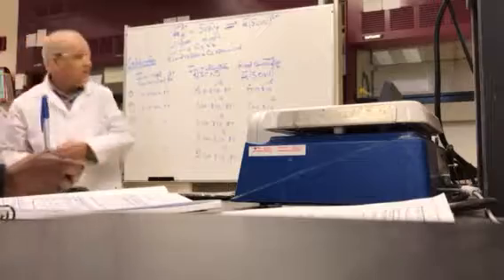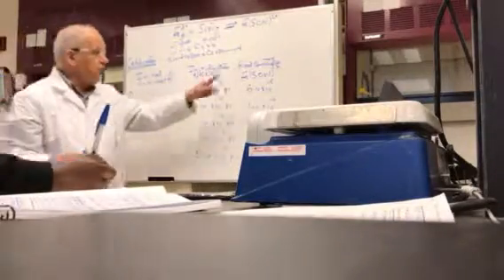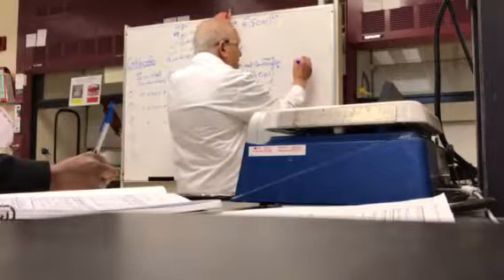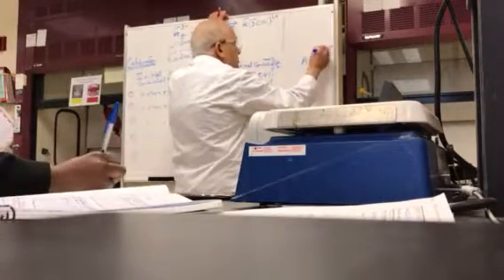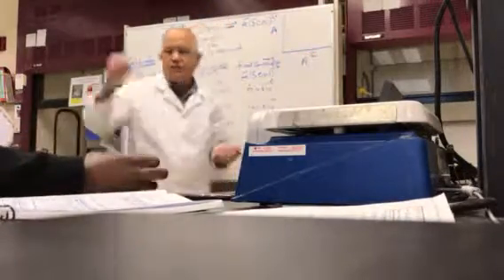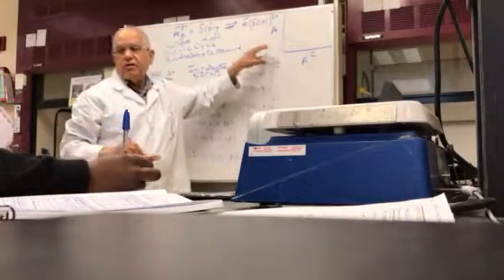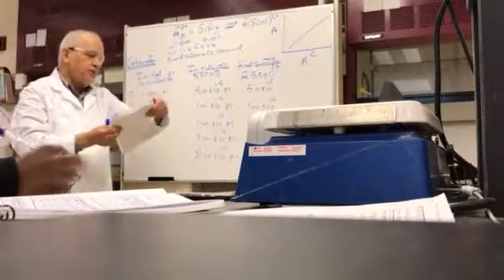This is the calibration curve. Once I got this data and I have the transmittance, like what we did in the light absorption versus concentration, convert it to A. You will have A here, the absorbance. You need to draw a graph with Excel. A versus C. Please, I saw some people in the back doing the reverse. A versus C, because that's what Beer's law says. A equals abc. You're going to get a linear graph, and there's a slope on that. The graph will look like this. We already did this. And then I'll look for the linear equation.